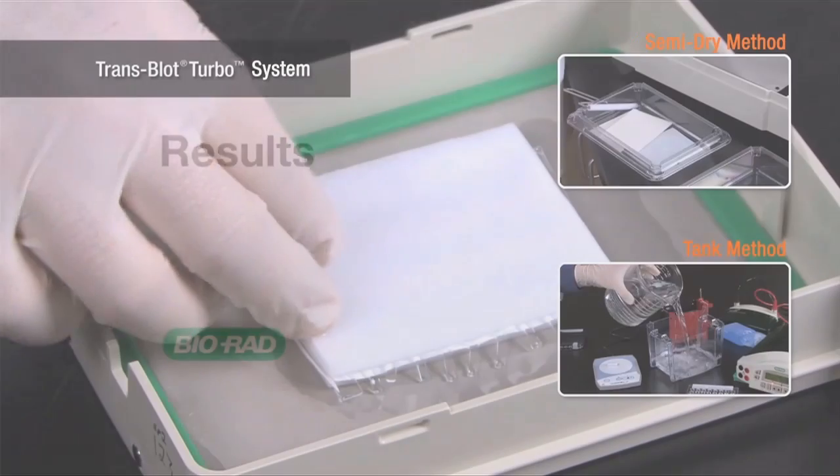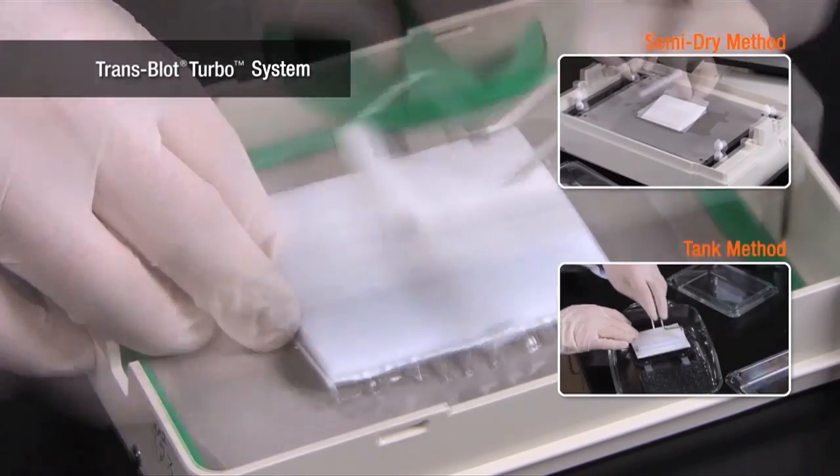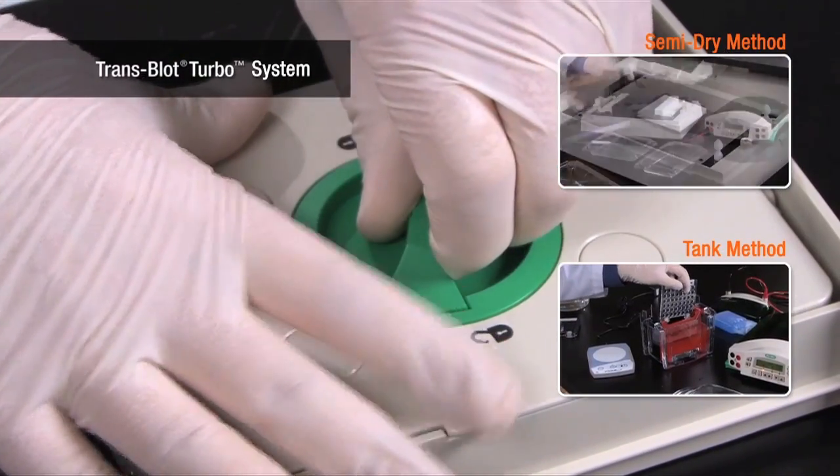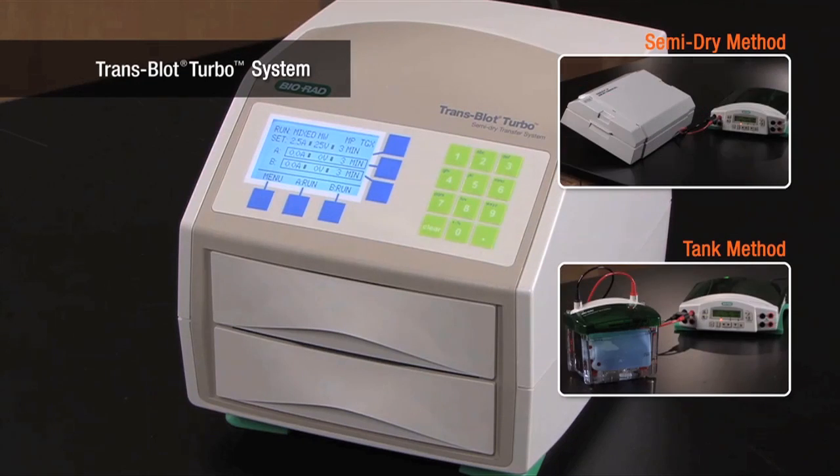Now, let's compare system performance. Here, we have set up transfers of BioRad's TGX gels using the Trans-Blot Turbo, along with transfers using the traditional techniques. Let's see how these systems performed.